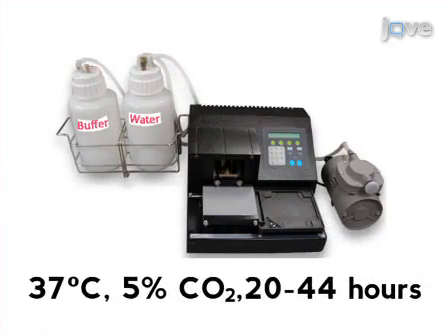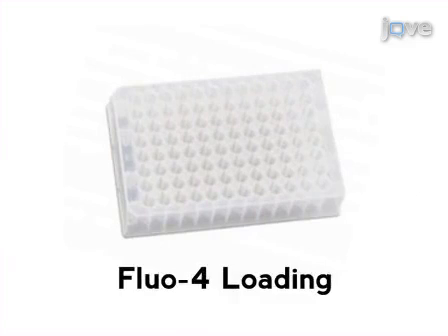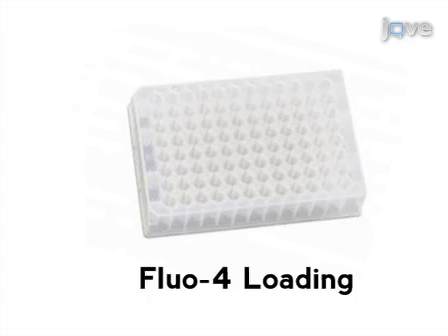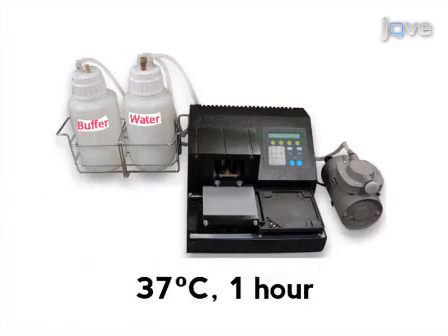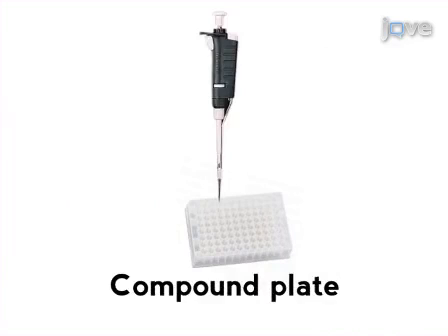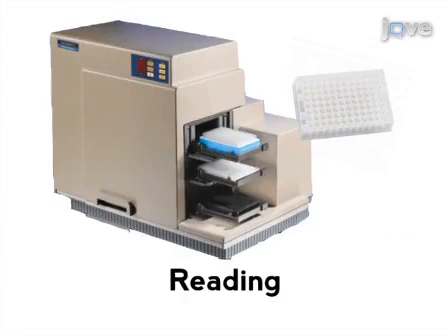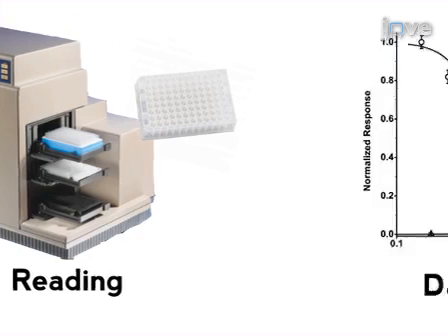After washing the cells in a microplate washer, the cells are loaded with the calcium-sensitive fluorescent dye Fluo4AM. A cell loading period is then followed by several additional washes. The next step of the procedure is to prepare the compound plate, including a TRPA1 agonist and a putative TRPA1 antagonist. As a final step, the software parameters are set up for plate reading in the FlexStation 3 system.